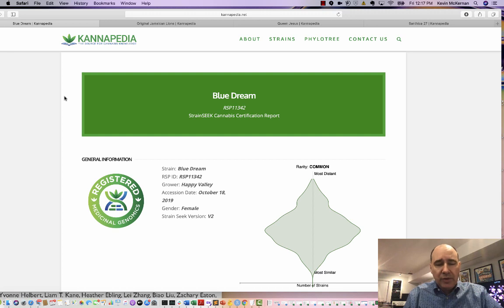When you do sequence with us, the SureSelect system from Agilent is being used in this case. We also have some panels that we're developing with Arbor, and you'll see those shortly. But this sequences 3.2 million bases in the plant, and it does it with a targeted hybridization capture that can collect any region of the genome and sequence it. In this case, we have selected around 25,000 SNPs that can be detected with the sequencing panel.